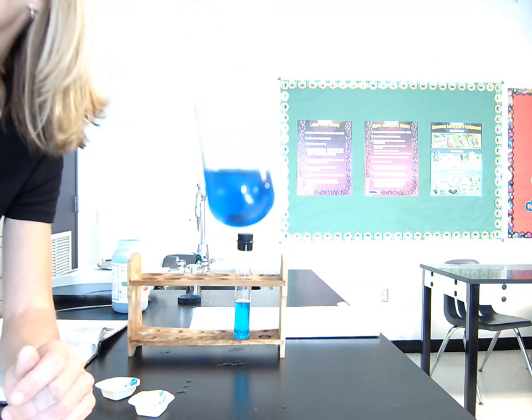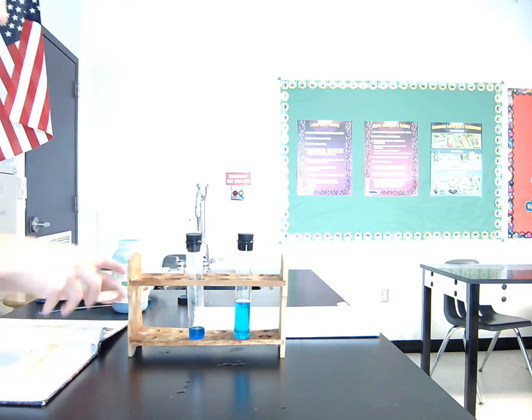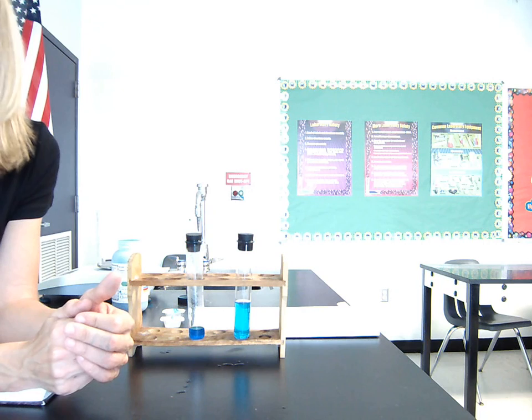There it is. I keep shaking it so it moves. There it is again. Right there. So again, you have to be able to physically see that there's leftover substance that will not dissolve. That is how you absolutely know it's saturated.